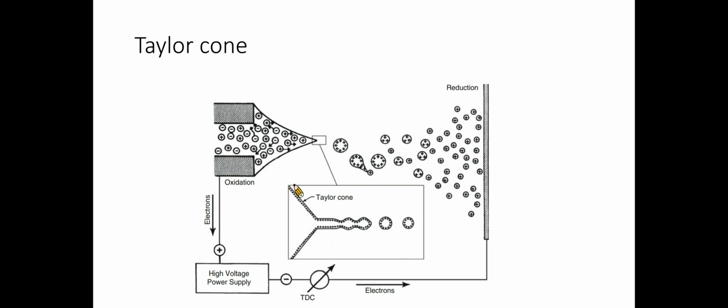60,000 singly charged ions. All those charged droplets are driven away from each other by Coulombic repulsion and move along the direction of the electric field towards the heated capillary. Overall, under positive ion mode, a positively charged aerosol is formed, and in negative ion mode, a negatively charged aerosol is formed. The positive charges are mostly contributed by protons, and the negative charges are contributed by some negative ions.